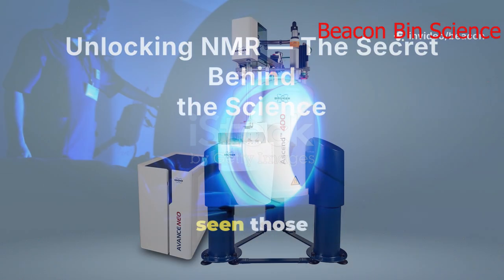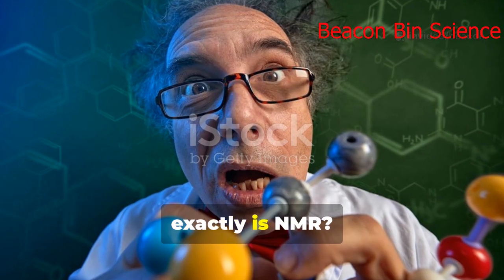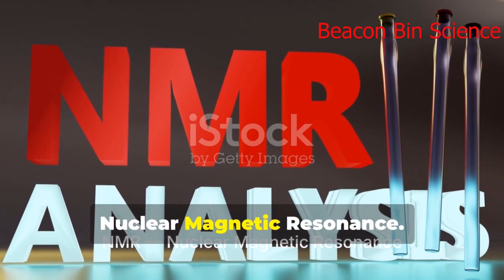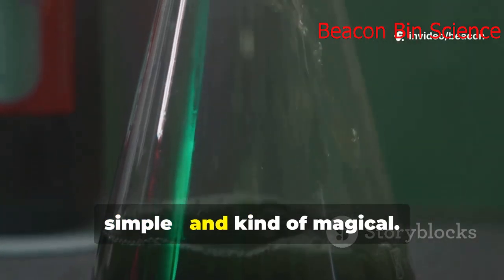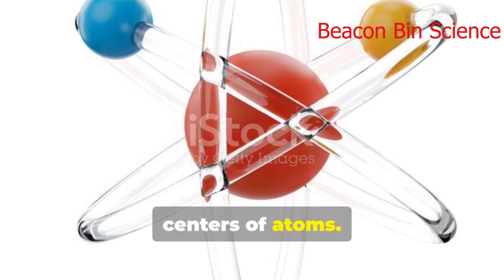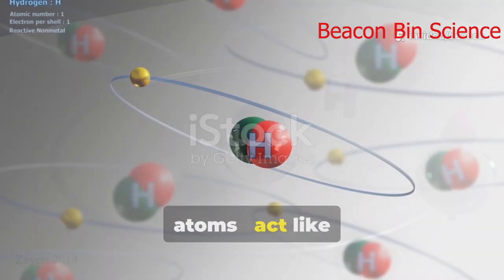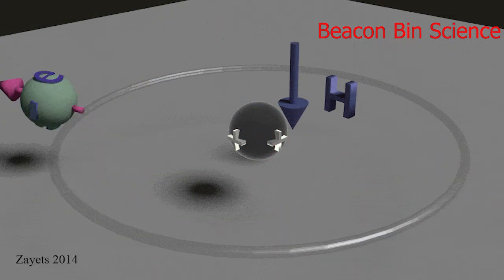Alright, so you've probably seen those crazy-looking machines in science labs with big coils and warning labels and wondered, what exactly is NMR? Let me break it down. NMR stands for nuclear magnetic resonance. Sounds intense, but the principle is surprisingly simple, and kind of magical. At the heart of it all are tiny particles called nuclei, which are just the centers of atoms. Some of these nuclei, like the ones in hydrogen atoms, act like little magnets. Yup, each one is spinning and generating a magnetic field.